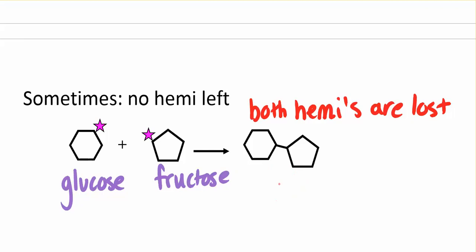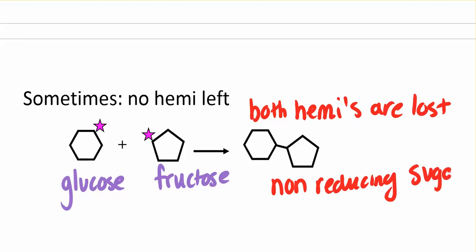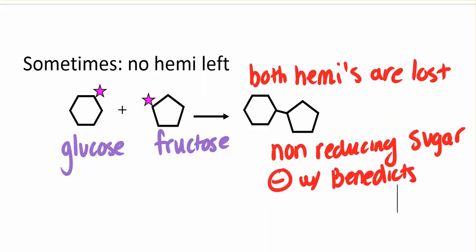And so this is a non-reducing sugar, which means it will be negative with Benedict's, no color change. And by the way, sucrose is like this.